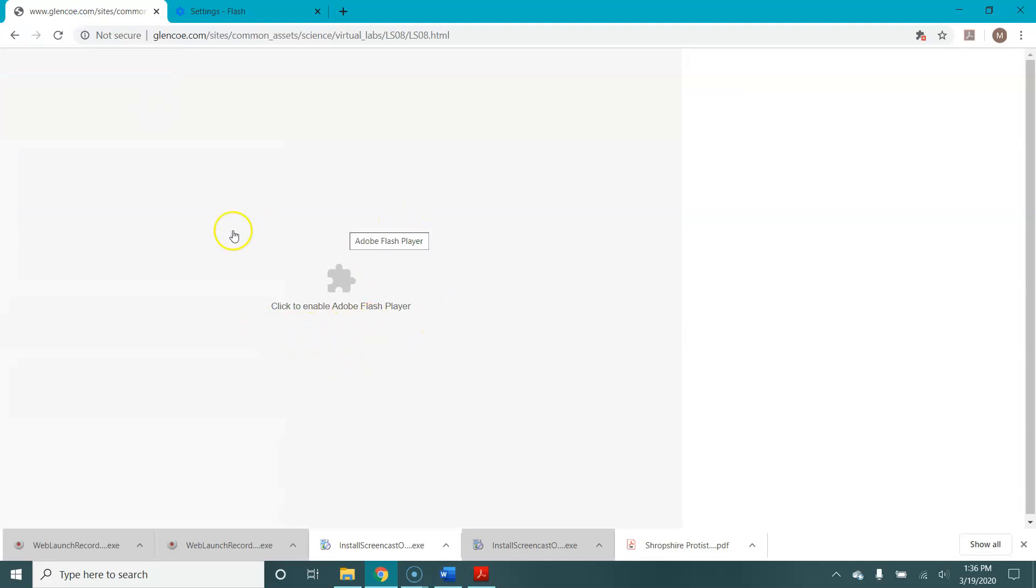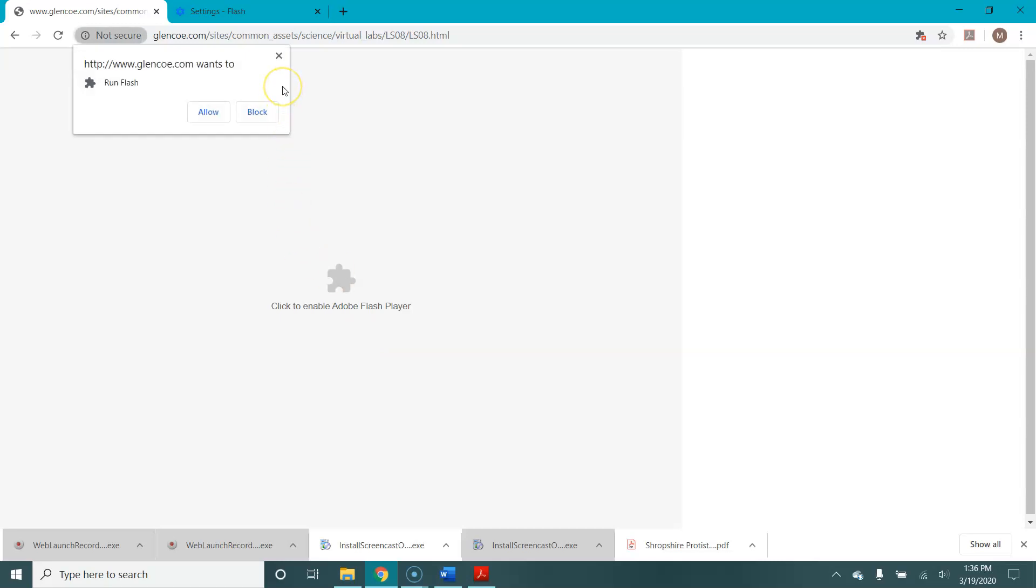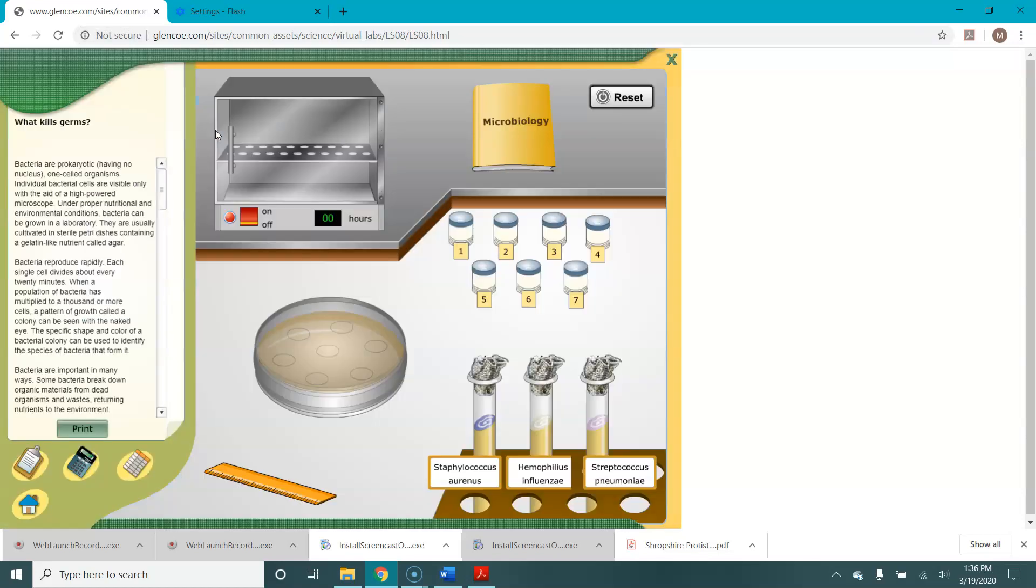So let's go back to our lab site. Now you can see that it says click to enable Adobe Flash Player. We click and this box pops up that asks if we want to allow or block it. We're going to allow Flash to run and our lab comes up.